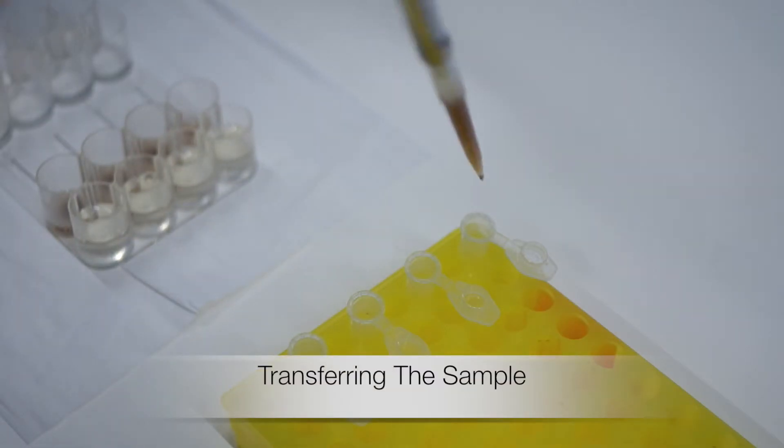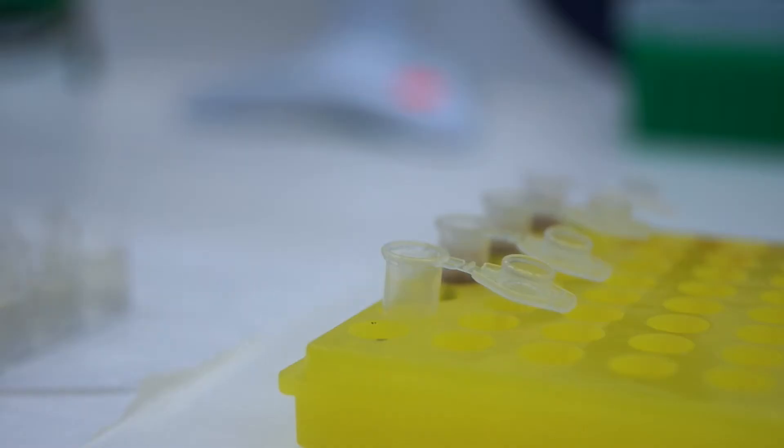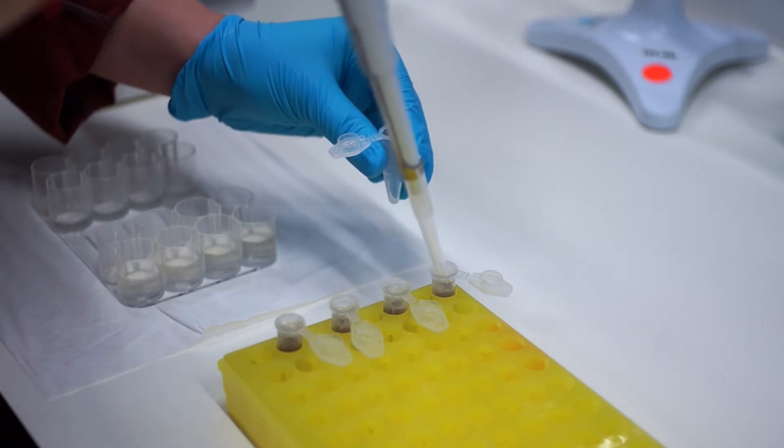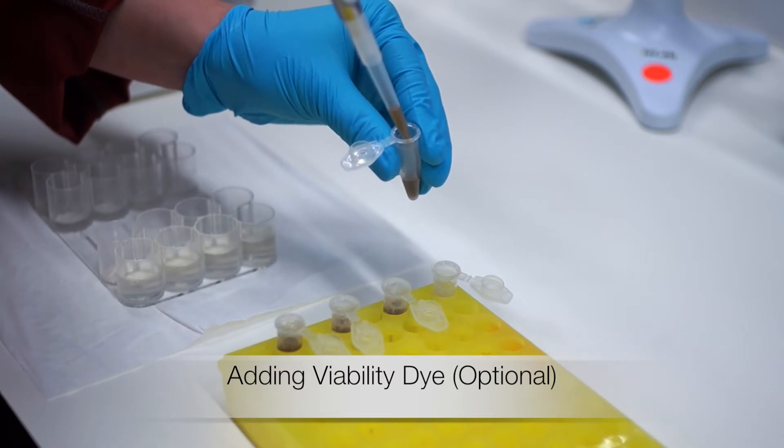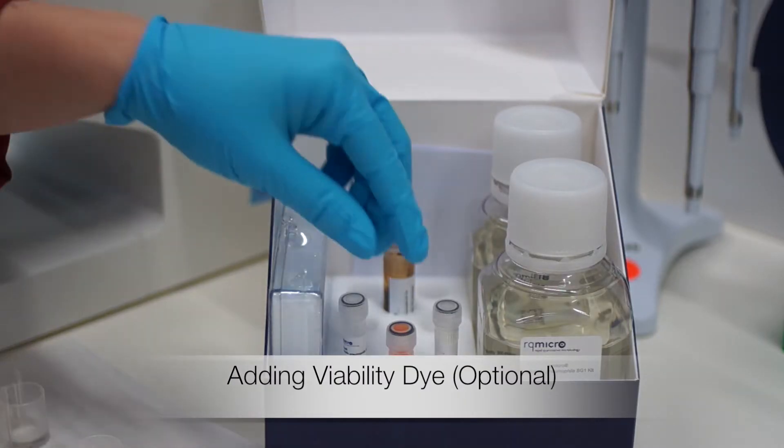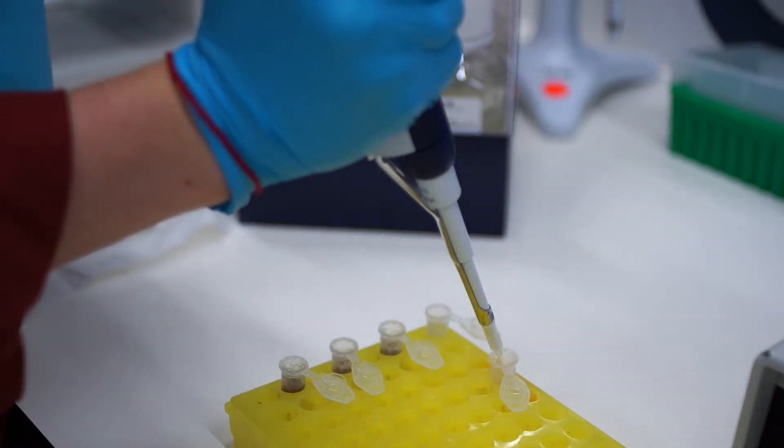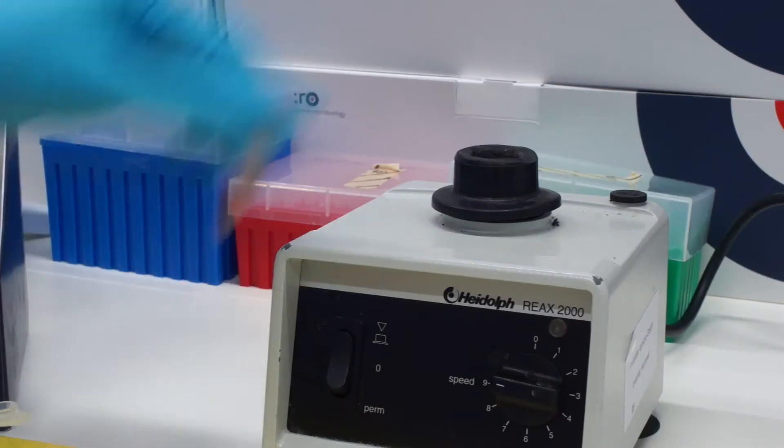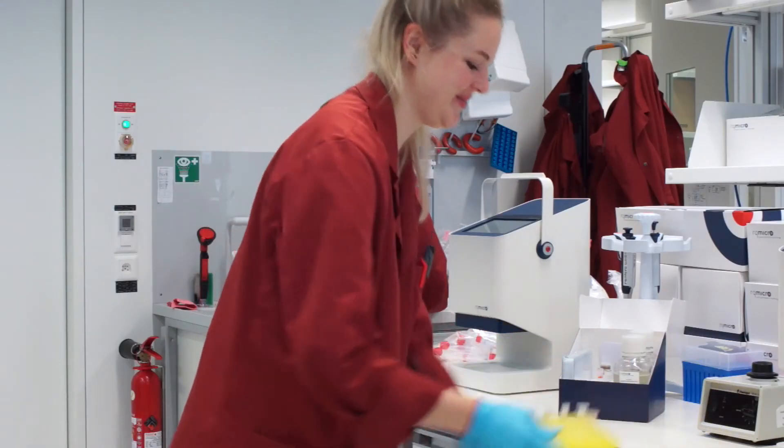In order to analyze the samples with the flow cytometer, I transfer my positive fraction into clean Eppendorf tubes. If I want to distinguish between live and dead Legionella cells, I transfer half of my sample, 500 microliters, into a fresh Eppendorf tube and add 5 microliters of the RQ Macro viability dye. I vortex and incubate for 10 minutes.